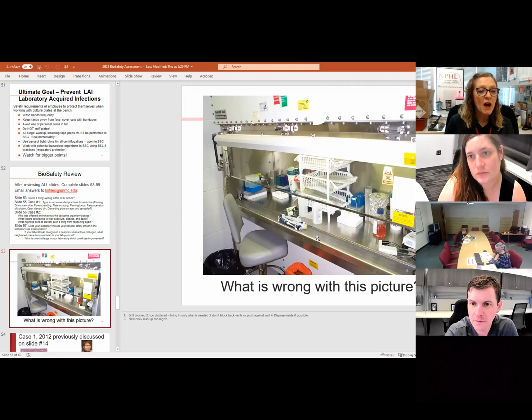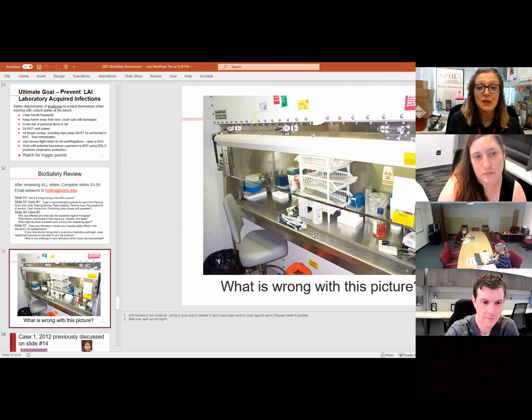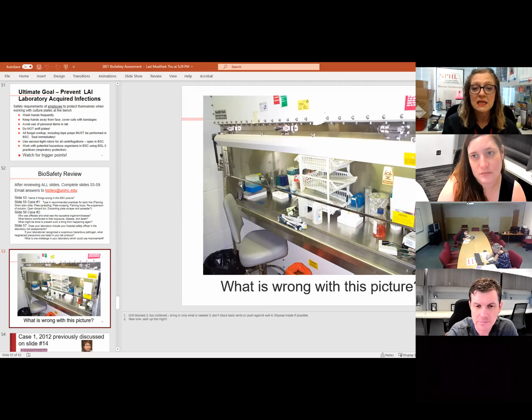The last one, number 5, was the sash. I didn't realize it, but you look, here's their yellow line, if you can see my little arrow, and the sash is way up here. Obviously, that might have just been because they weren't using it at the moment they were taking pics. But if that's where they're leaving it, obviously it's going to be bellowing with an alarm, hopefully. And they will have air leakage if they really do continue to use it this way.